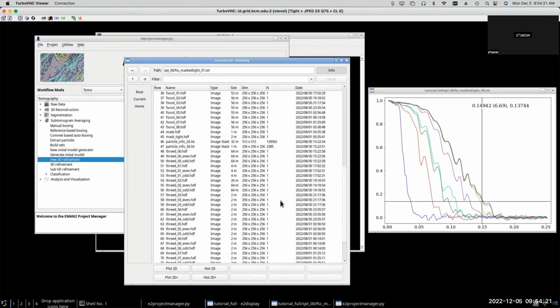Steve, can I ask one more question? So it's easier to understand going from 3D alignment and changing to 2D. But when you switch back to the 3D, are you using any of the orientations generated by 2D alignment and reconstructing into 3D particles for each one? Yes, it's always using both. The 2D alignment parameters are in-plane repositioning, and the 3D alignment parameters are full 3D orientation information, which again is constrained to be self-consistent among all the particles. So the 2D alignment parameters are sort of adjustments to where the center of each particle is within its subtilt series.